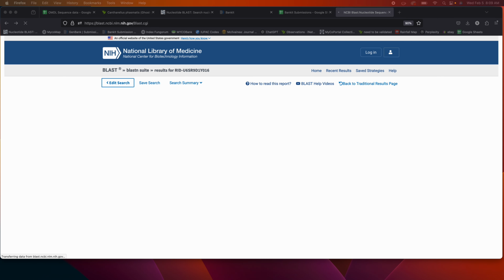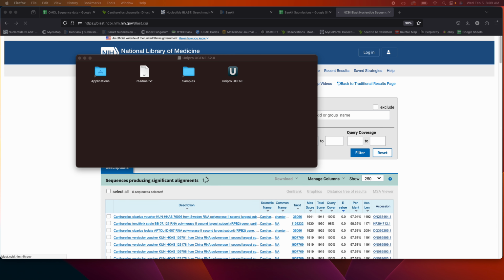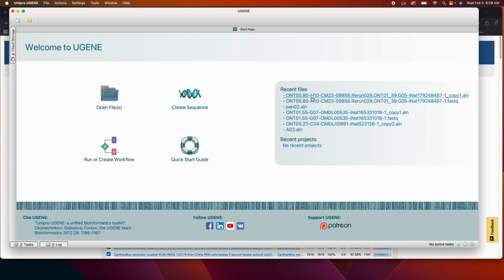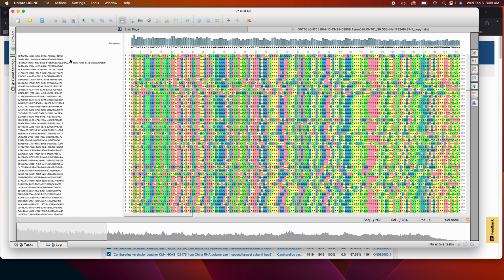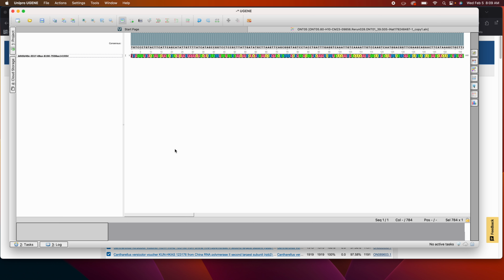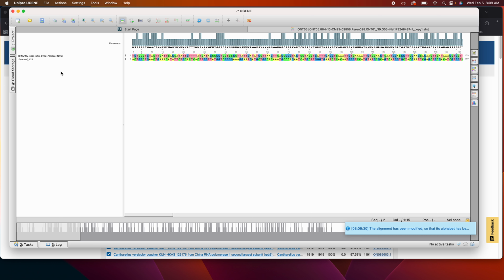I don't know if you're familiar with this program, but it really helps to have something like that so you can count the nucleotide positions, and that'll become important when you annotate the CDS. So give me 1 second.